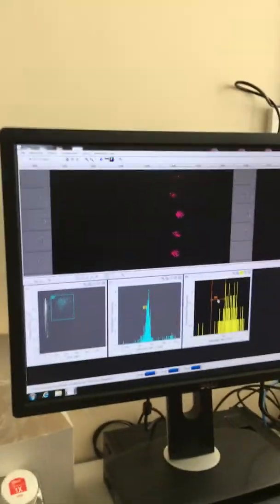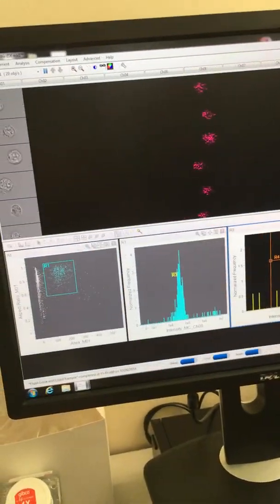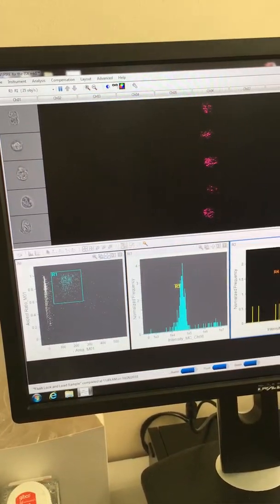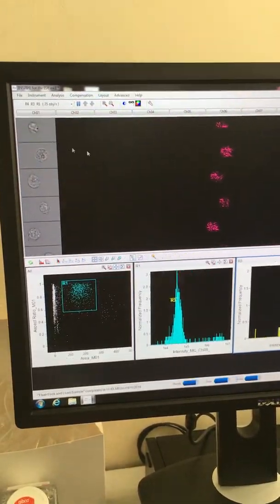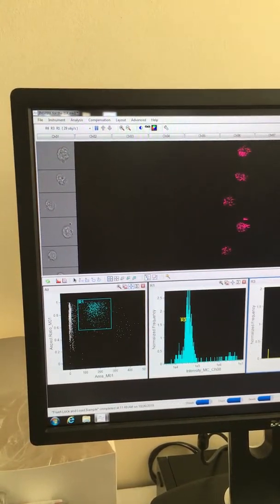I don't know why. Do you want me to just? Yes. Okay. Where was this? I don't know exactly, but we'll just put it here so we know that it's positive. But next time don't move that. You move that side and then press that. And then you want to view R4, so that now you know you're viewing your positive population.